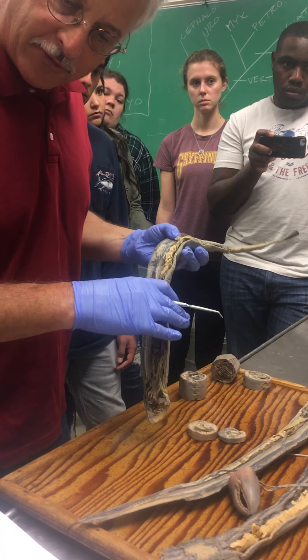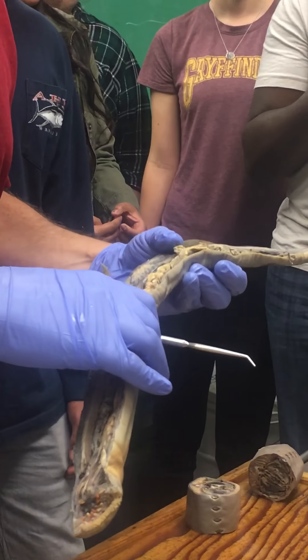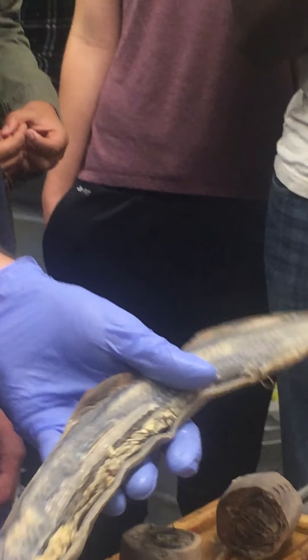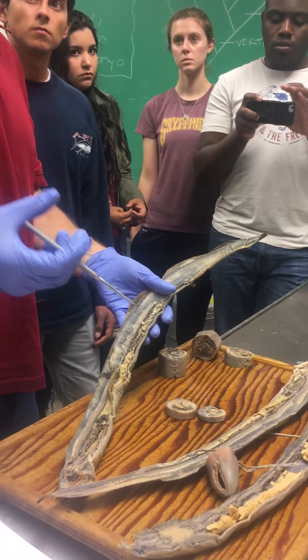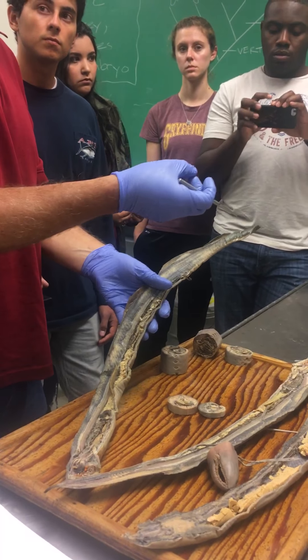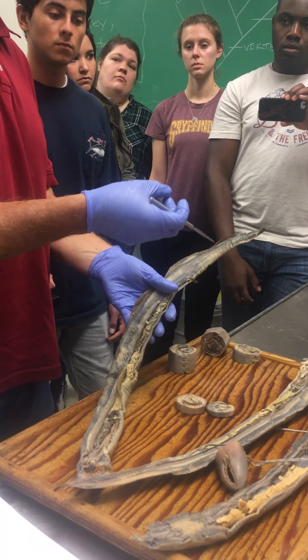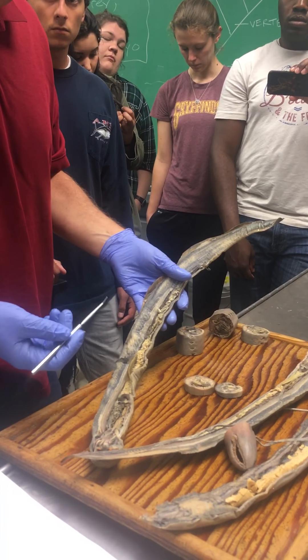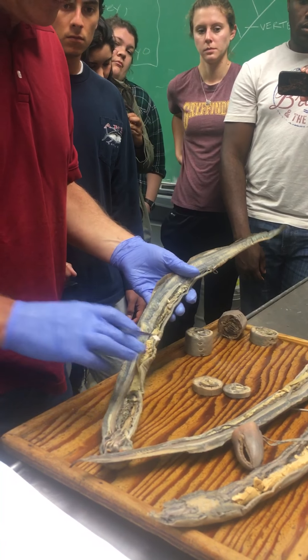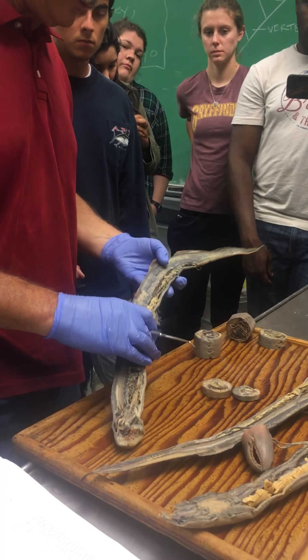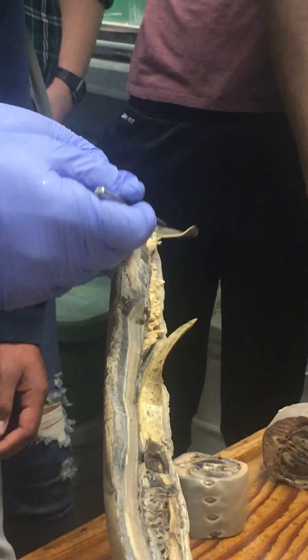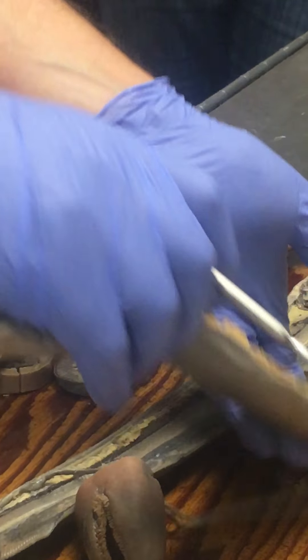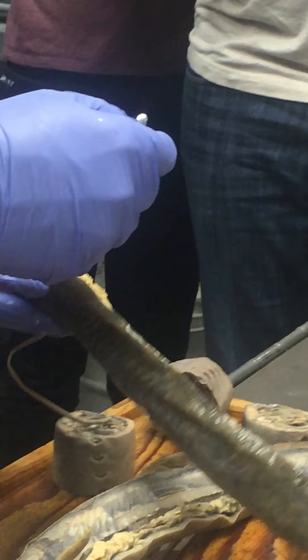The urogenital sinus is the space where the two archenephric ducts come together and join the genital ducts inside the urogenital papilla. And the gonads — there's the testis in males, and there's the ovary in females.